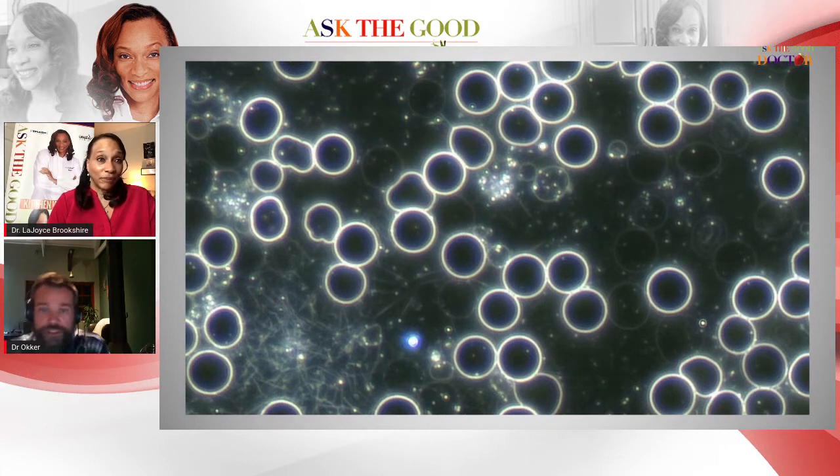All right, so this is again just some candida, those fine light bubbles throughout the plasma between the red blood cells. Those all indicate an issue with candida. This type of presentation, when we see it to this extent, is a sign of chronic candida. This is usually the starting point, and this is what we really focus on to get results.